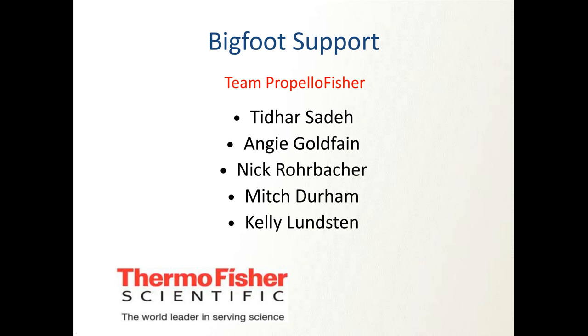I think a panel optimized for the Aurora is not going to be optimal for the Bigfoot, and vice versa. So right now, one of our current quests is to come up with maybe 15 colors that you know is going to work great on both. And that's what we're moving towards now. The 12 color panel we have that I'm looking at from the Teton Lab looks like it might meet that. And we're seeing some little subtle differences in the unmixing, and that's what we're working on right now.